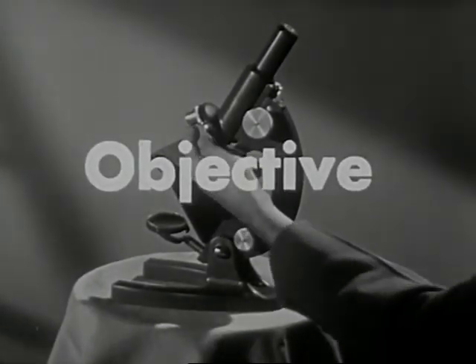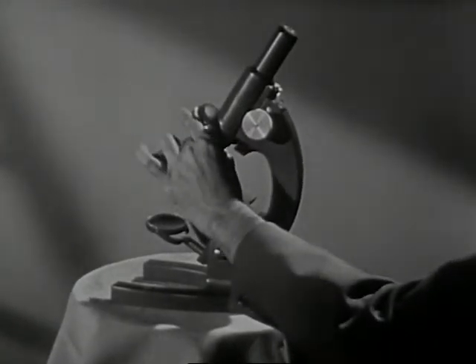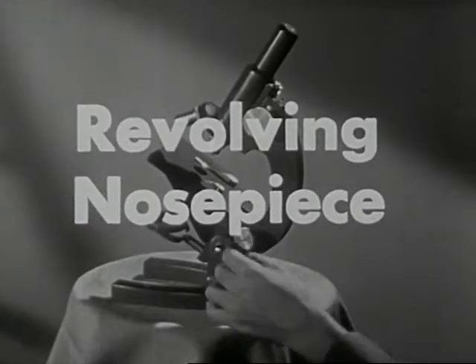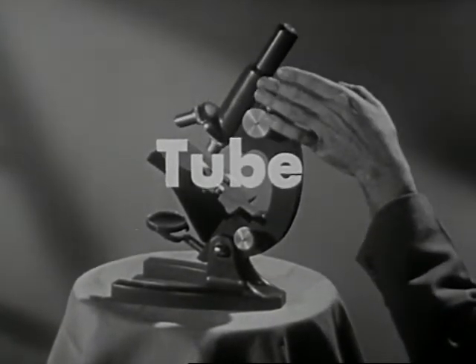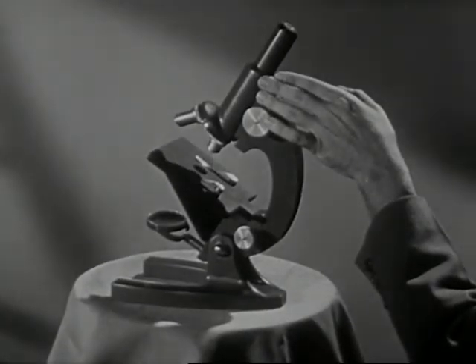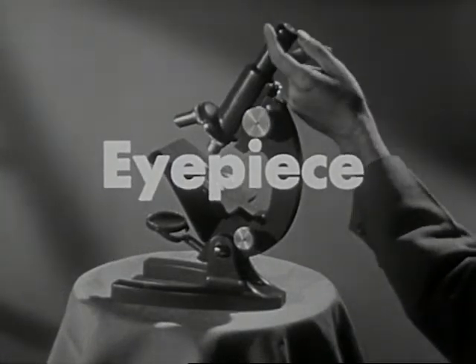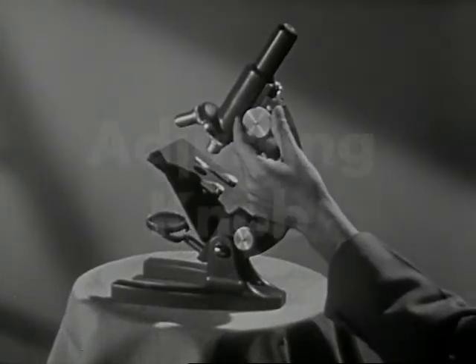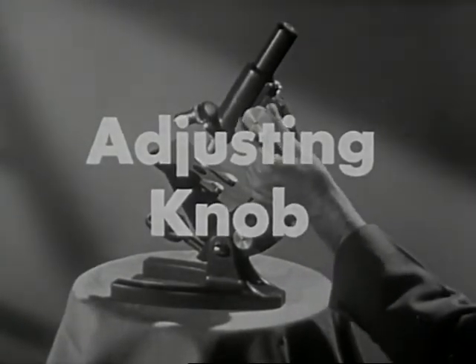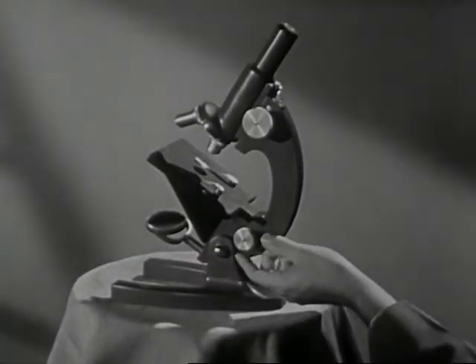The objectives are the lenses which are nearest the specimen, or slide. The objectives are attached to the revolving nose piece, which allows the objectives to be easily changed. The tube is part of the main body of the microscope, so named because of its tubular shape. The eyepiece is the lens located at the top of the tube, nearest the eye. The adjusting knob is used for focusing, and the mirror for reflecting light onto the specimen.